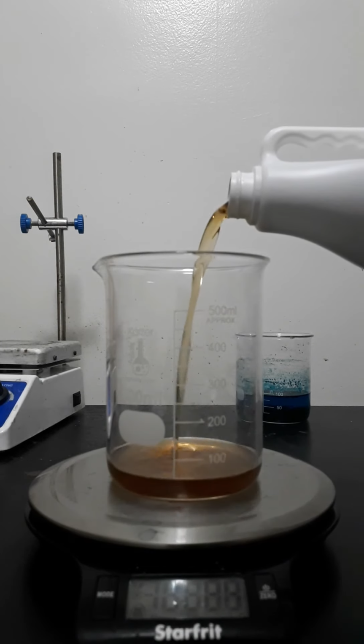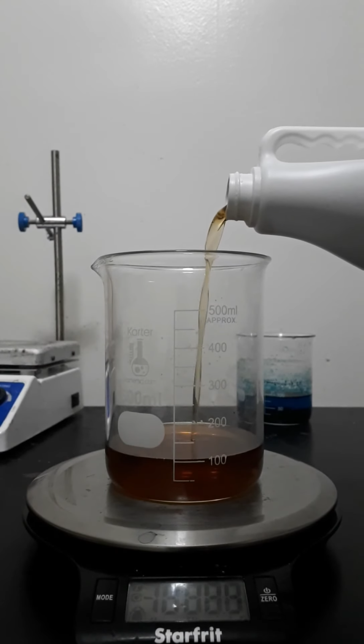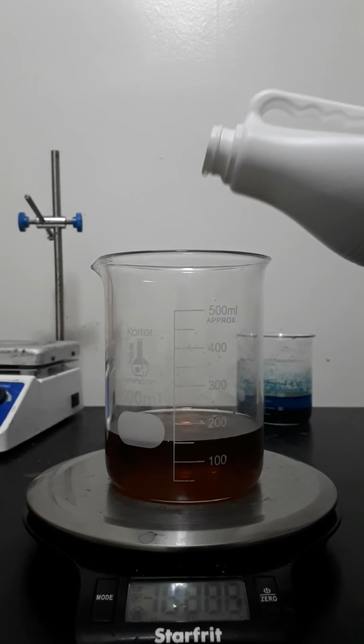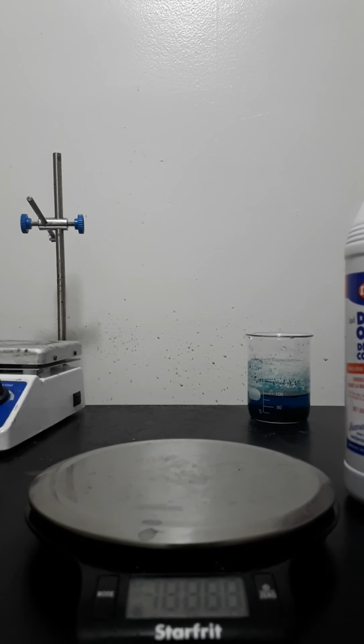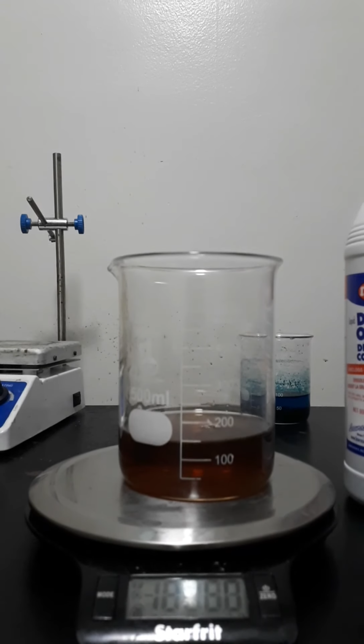The sulfuric acid's color has to be clear, and there are various reasons why it's not clear, but for our purpose I think it's fine, so we are not particularly bothered by the clarity of our sulfuric acid.